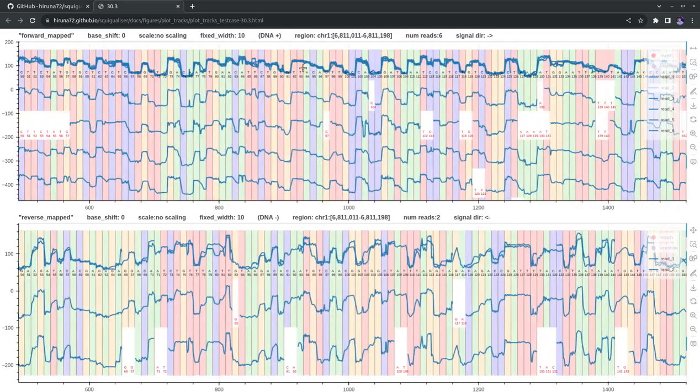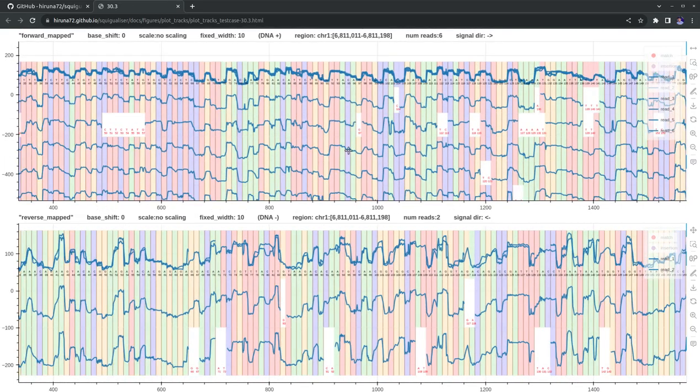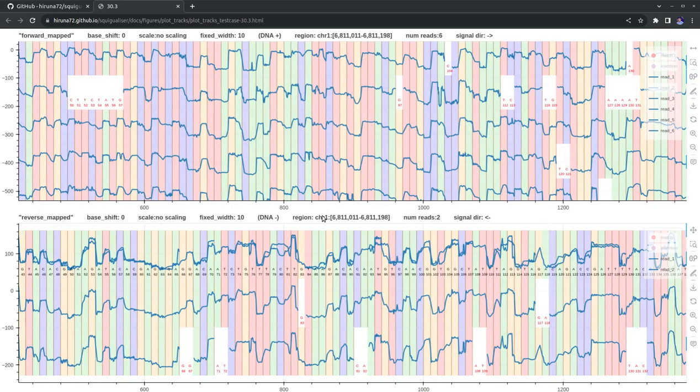I cannot move on the Y axis. Now I want to use the box zoom to have a close look at this region. When I zoom in on a single pileup, the second pileup also moves in with it, which is again really cool.